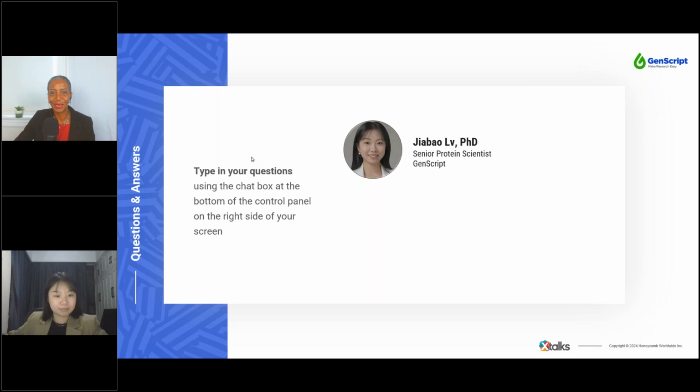Thank you so much for that, Jabo. All right, let's go to our next question. This is a little lengthy. This audience member is asking, could you share any data or insights on the in vitro editing efficiency of prime editors? Specifically, do you have any quantitative results or examples that highlight how efficient prime editors are across different target sites, DNA sequences, or pegRNA when tested in vitro? Jabo, what do you think?